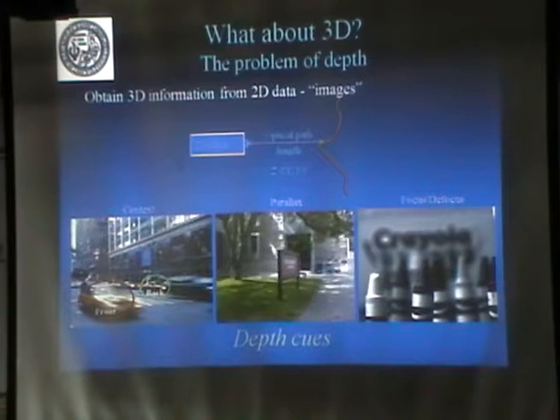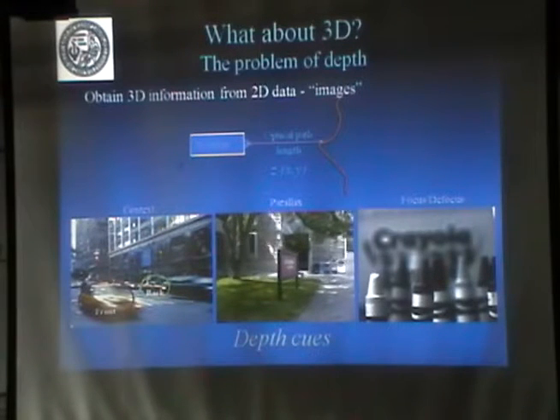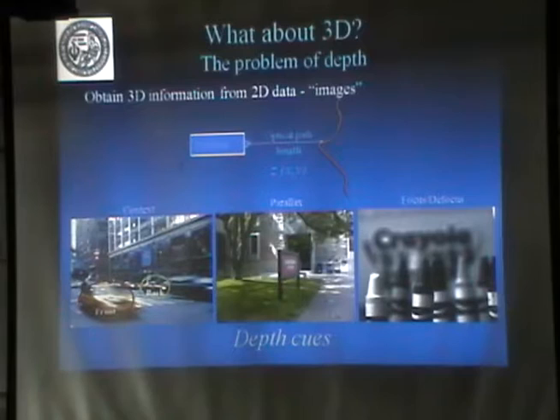Okay, you have two eyes that works. Now the problem with microscopy with the two eyes is that you don't have space in a microscope for two eyes. Because the objective is taking almost all the half space. So you can go to the other side, and that's cumbersome. Or you can cut the field of view, but then you reduce the numerical aperture. So this is not so good, although it's used in microscopy, but not for high-NA microscopy.